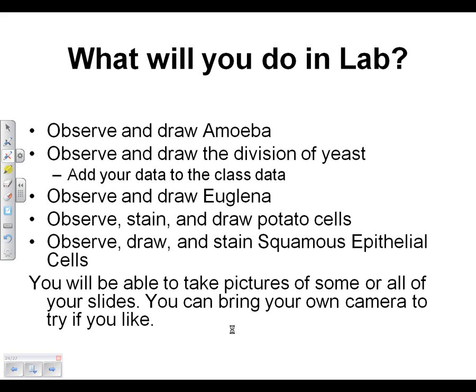If you suck up a little bit of that and put it on a slide, you probably will get an amoeba. The other thing to keep in mind when looking at the amoeba is to keep your light level as low as you can. Because if you have the light turned way up high and the condenser well focused, you essentially put that amoeba under what almost amounts to a laser. It's like standing on the sun for the amoeba.